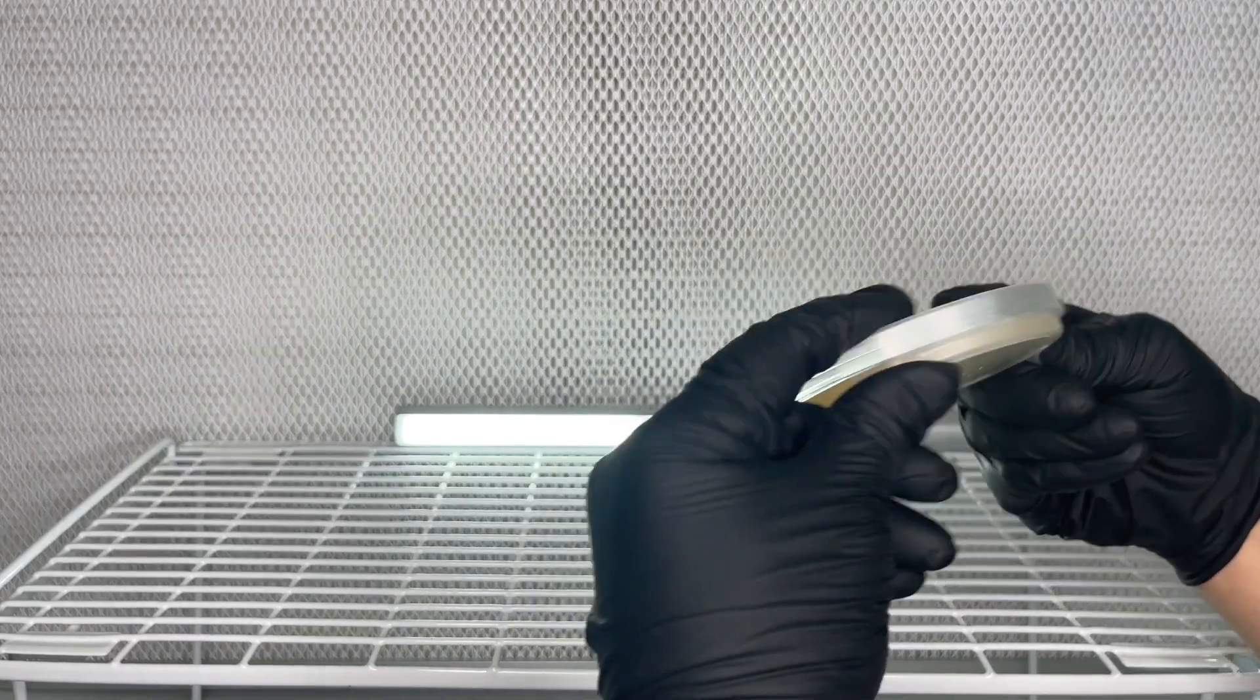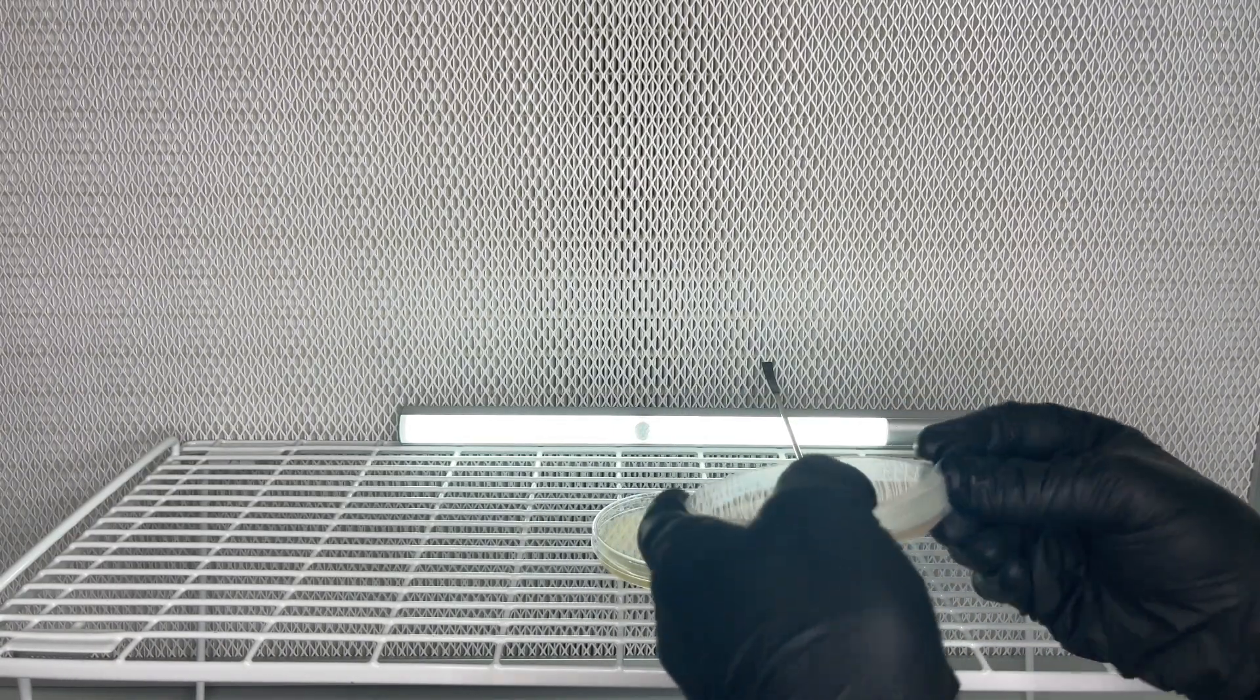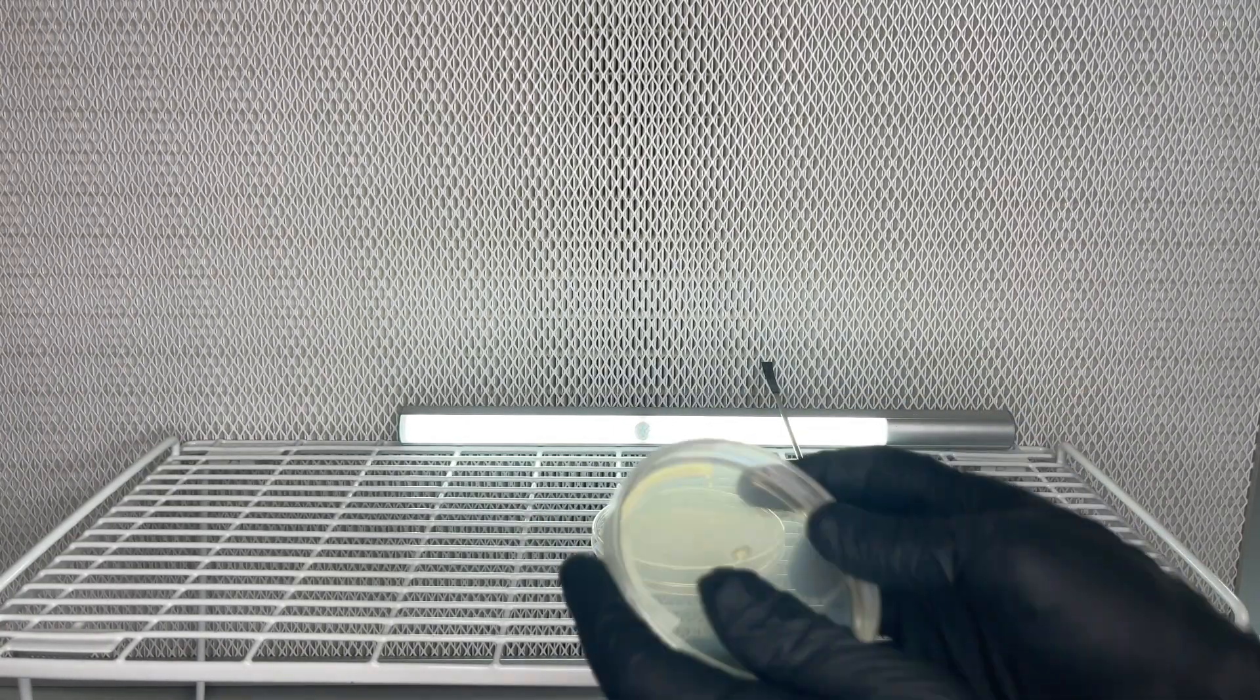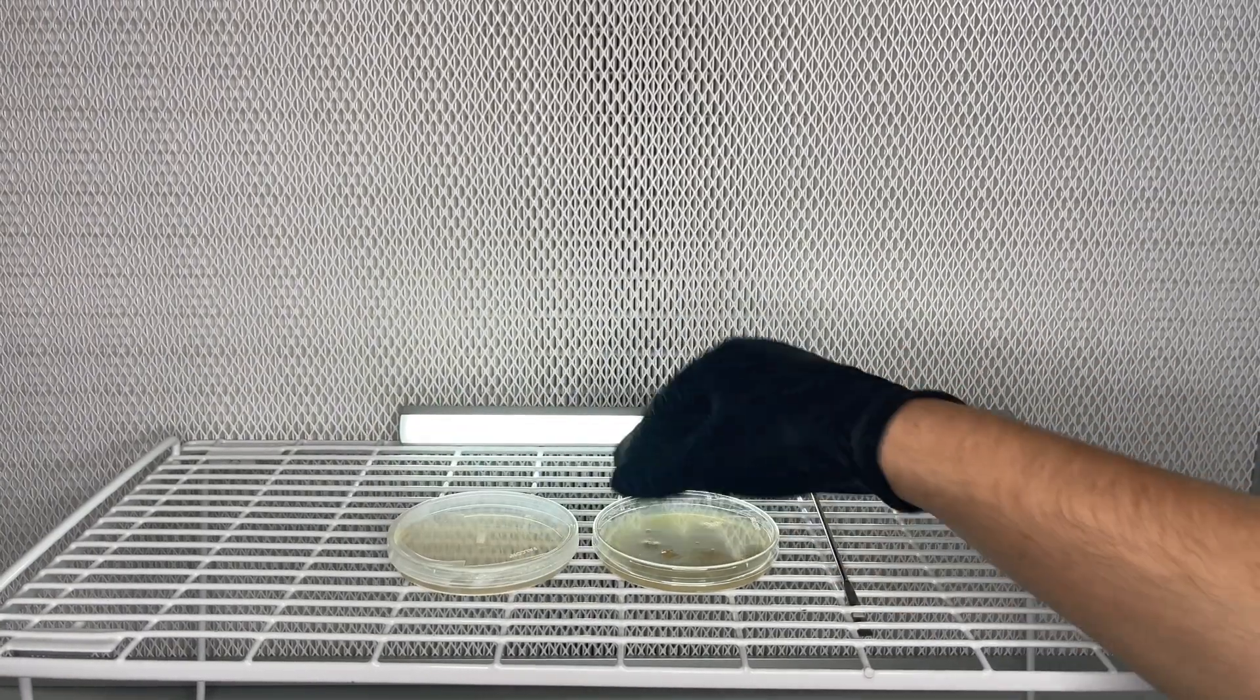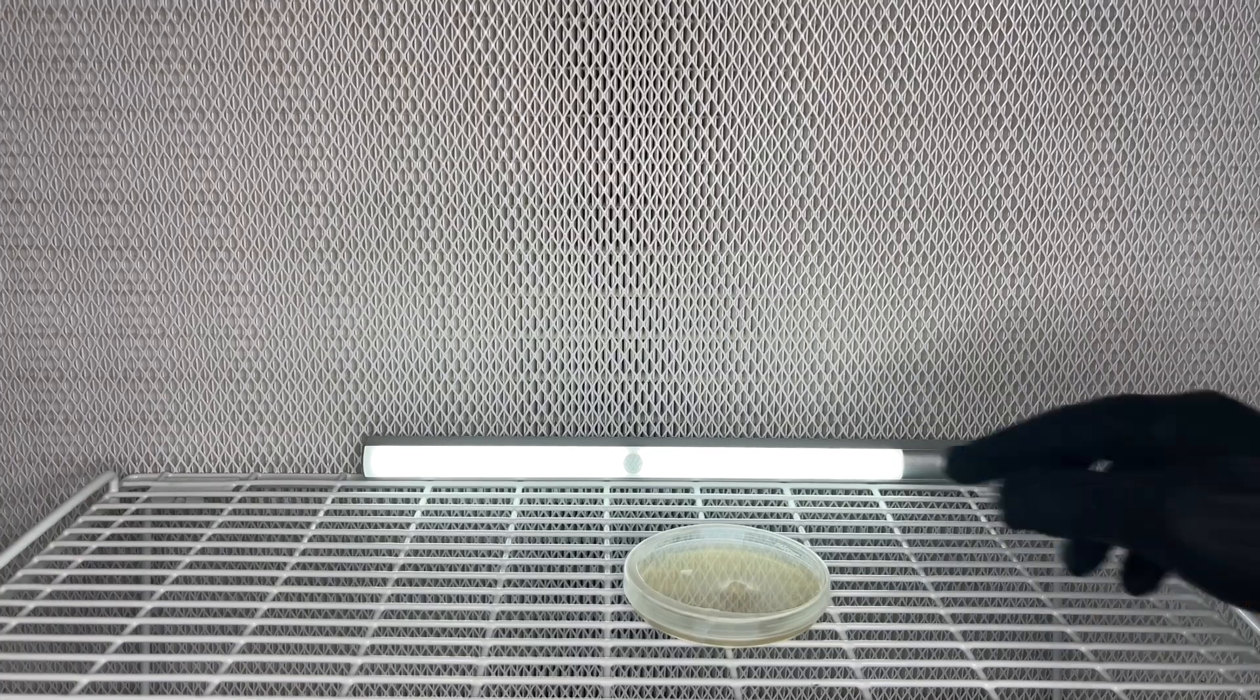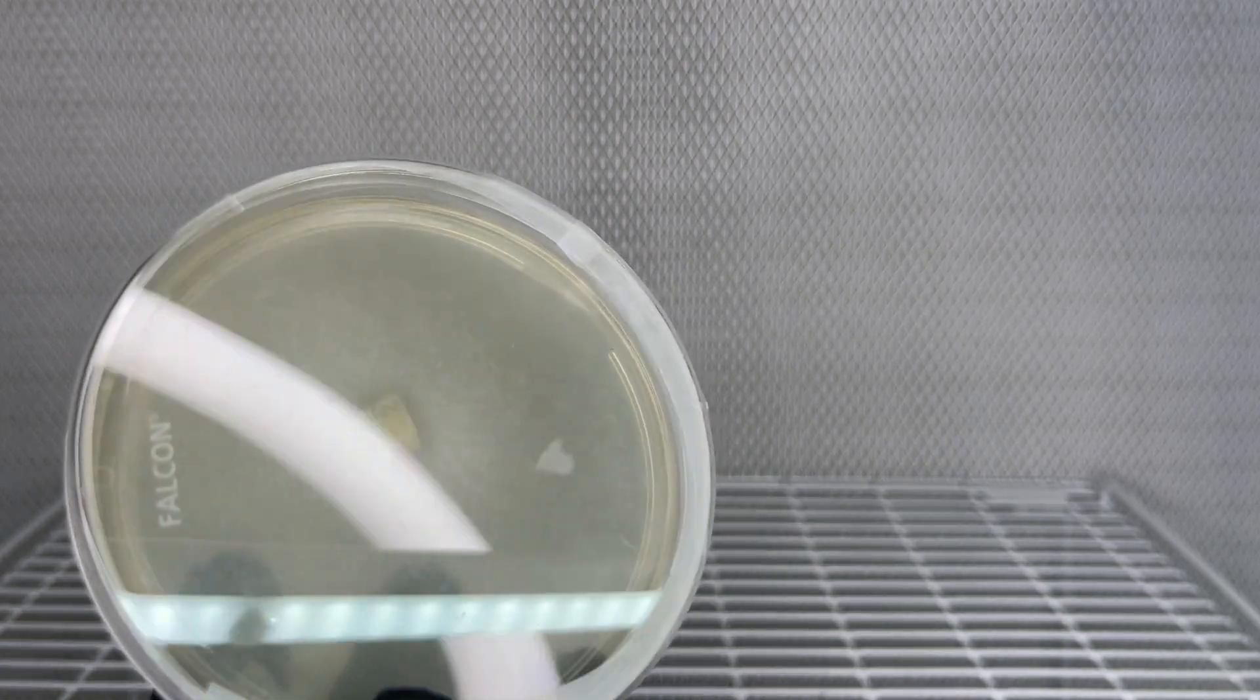And that's how you can save a contaminated mushroom liquid culture. Another way to use this method is to inoculate a small jar of grain with the contaminated syringe and do the same thing. Wait for the mycelium to grow up the side of the glass jar and then you'll be able to isolate it.